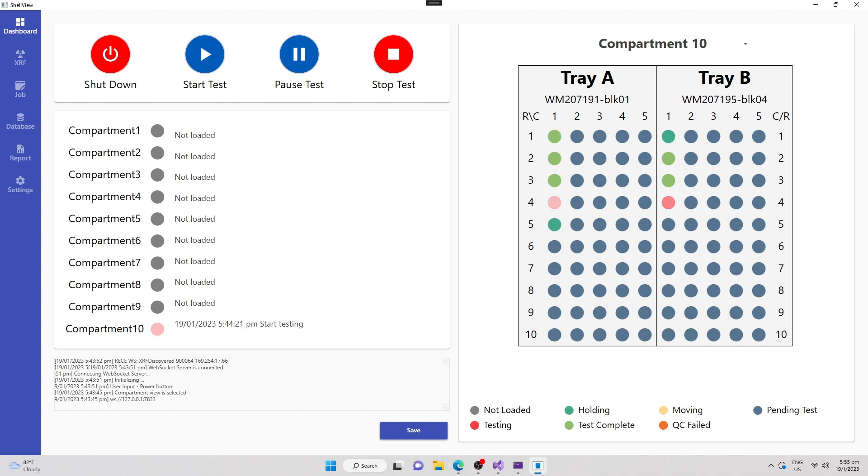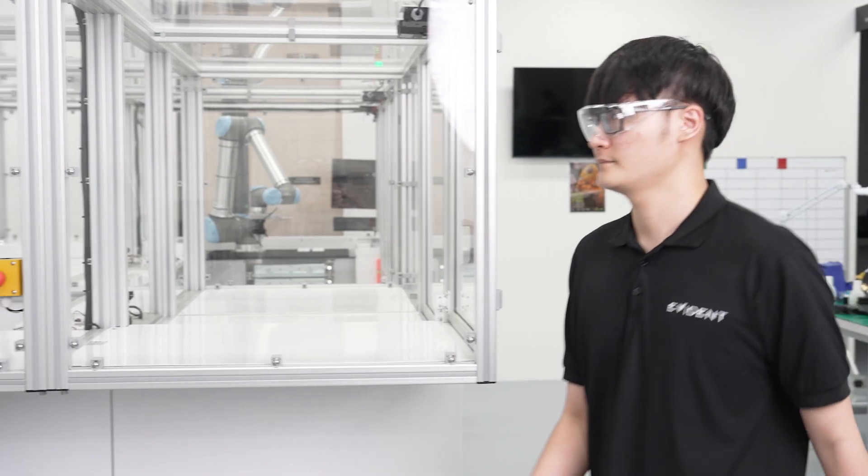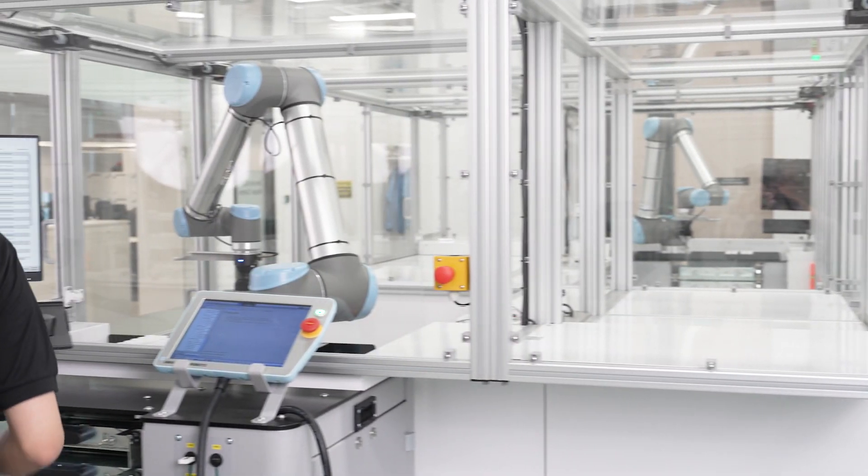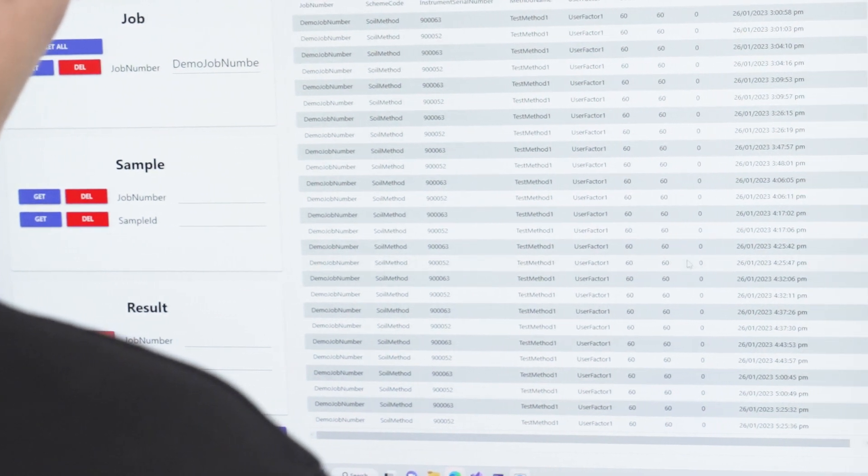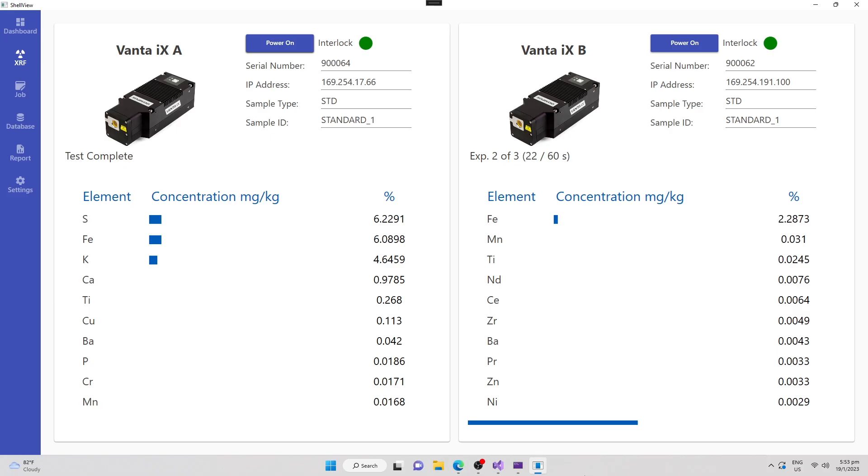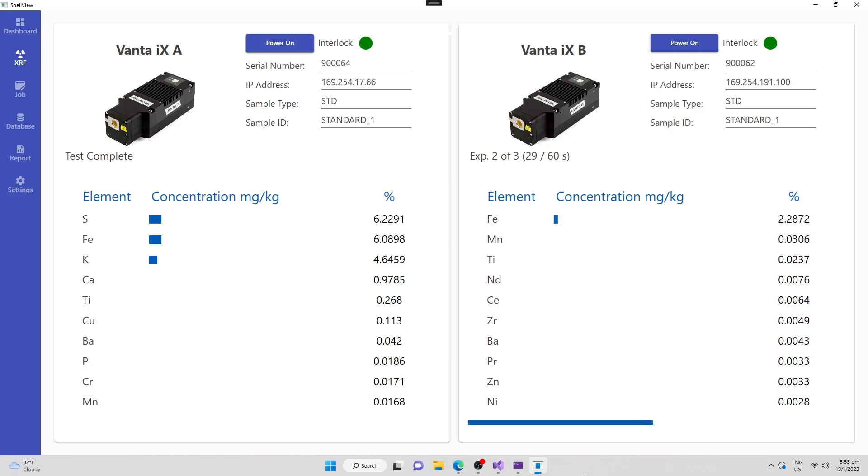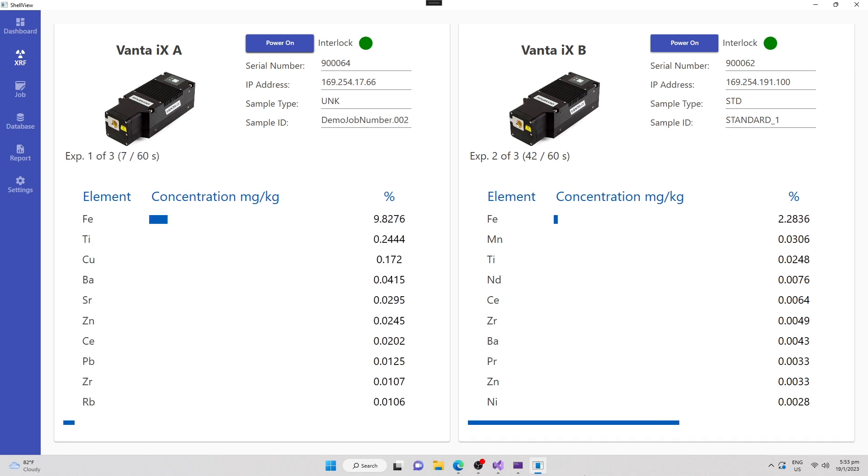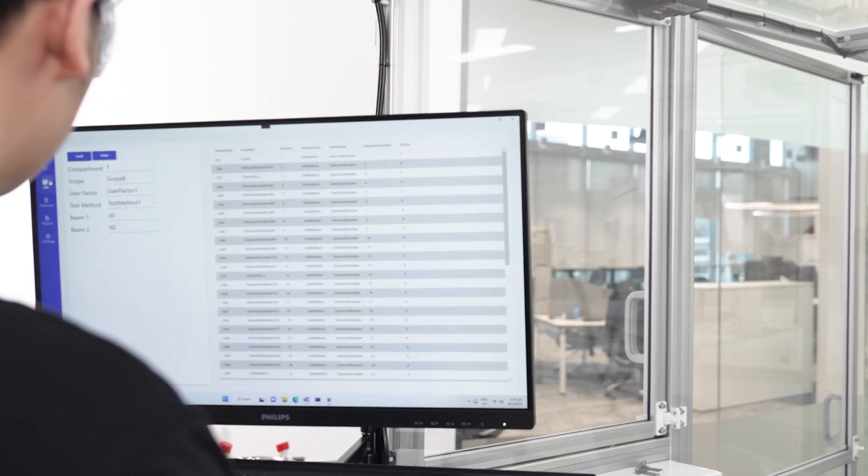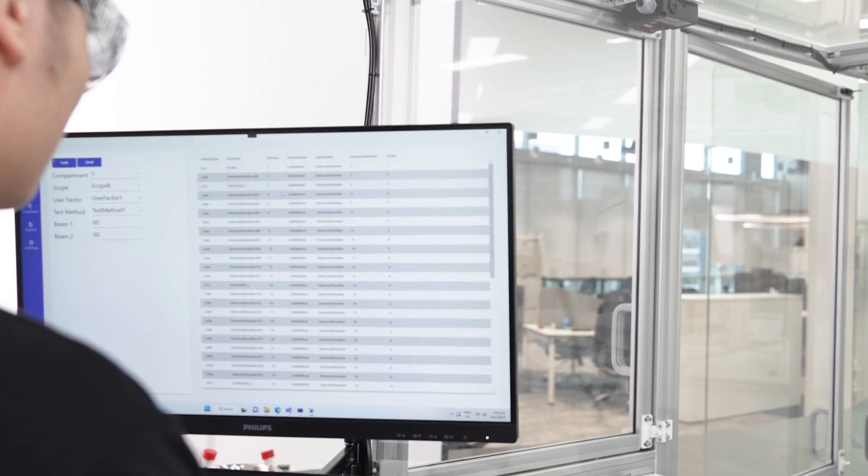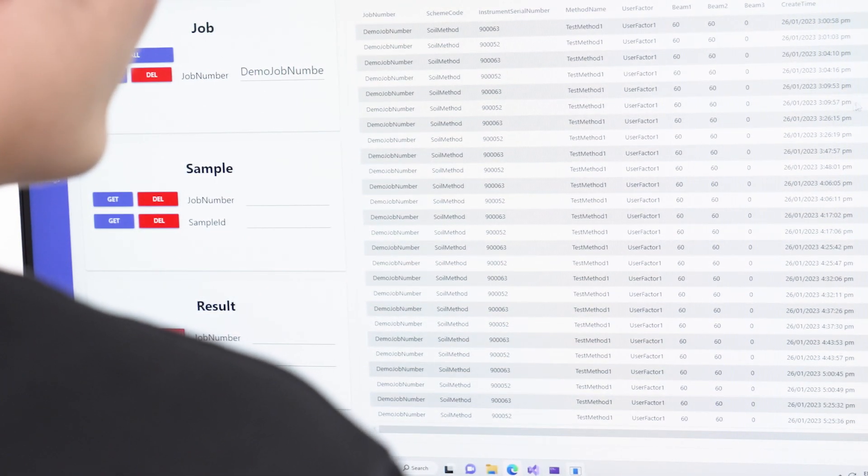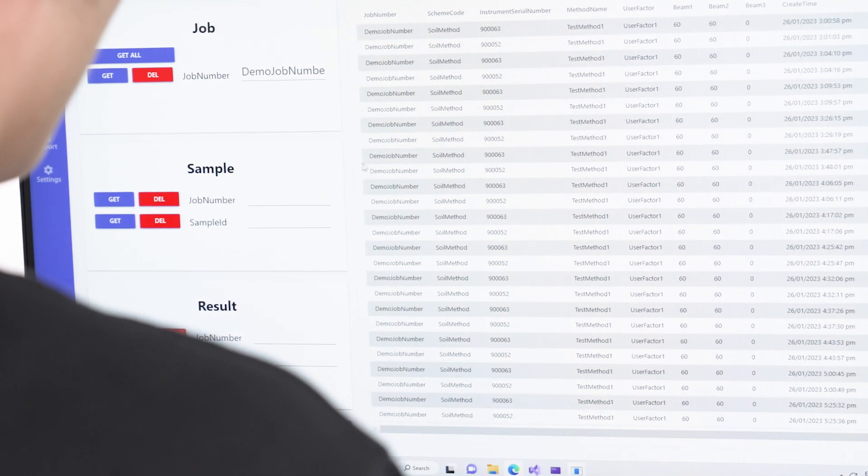Our customized software makes it easy to input your run list and display and record measurements, simplifying the testing process for enhanced efficiency. With its intuitive interface, you can manage and review your data quickly and easily.